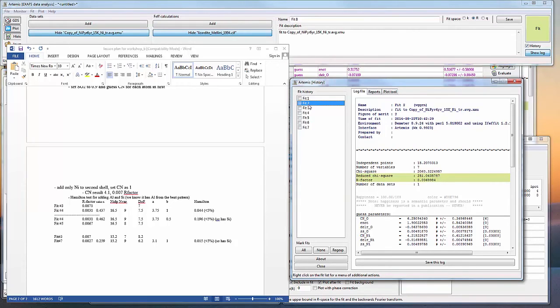So if we look at the R factor of 0.0069 for this fit, which has 7 fitted parameters, or free parameters, or number of variables, and we look at this fit here with aluminum and silicon added, and we only have 9 fitted parameters, and our R factor goes down to 0.002. Is that really a significant improvement? I mean, they're both reasonable fits. They both have very acceptable R factors.